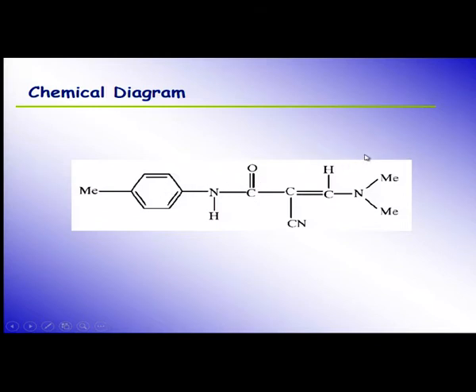So, he has given me the tentative structure he expects. Ring atom everywhere the C is there, methyl means CH3, then C nitrogen. If you count the total number of atoms here, non-hydrogen: 6, 7, 8, 9, 10, 11, 12, 13, 14, 15, 16, 17 atoms are there. So, your aim must be to get the 3 positions each for these 17 atoms.